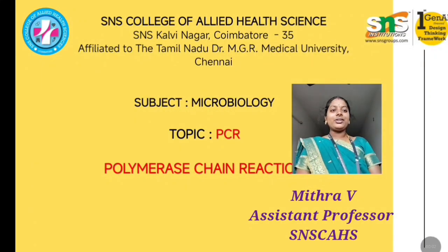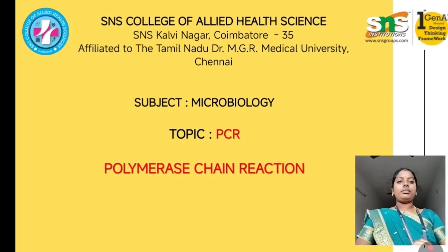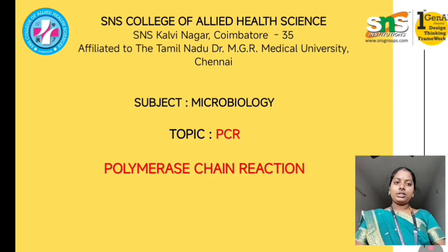Hello everyone. Today we are going to see the topic PCR. PCR is nothing but the polymerase chain reaction.